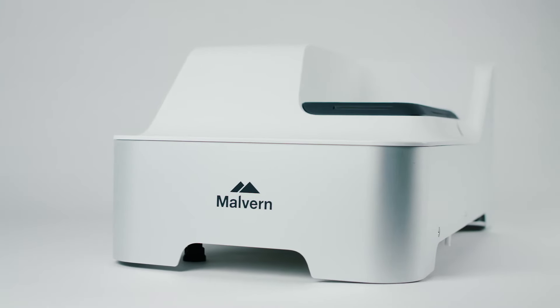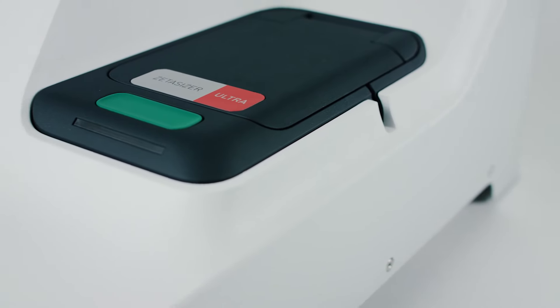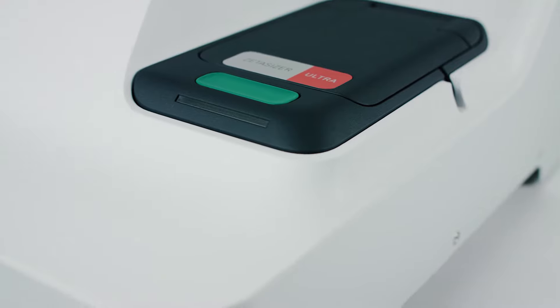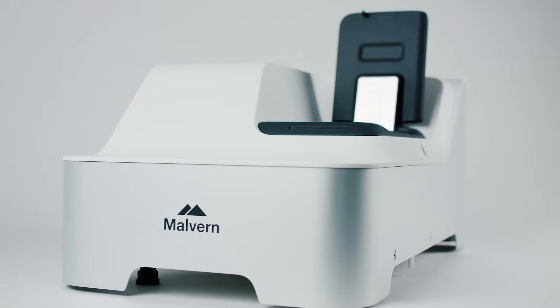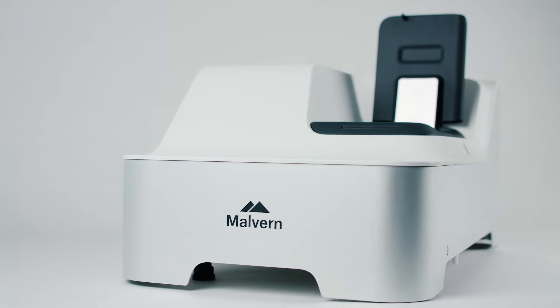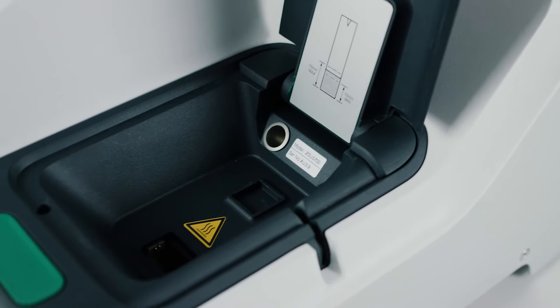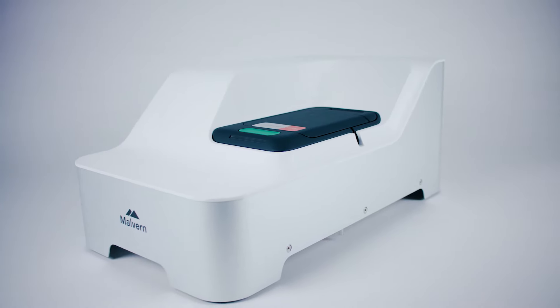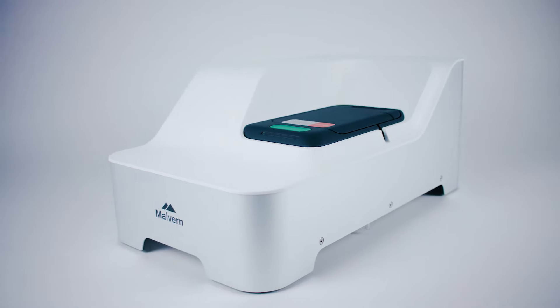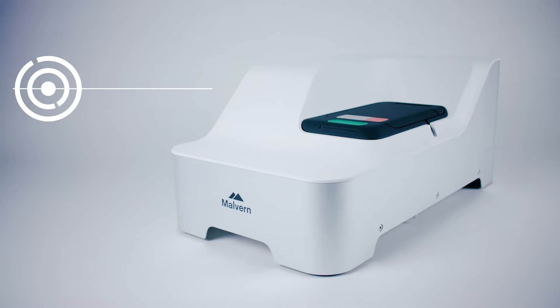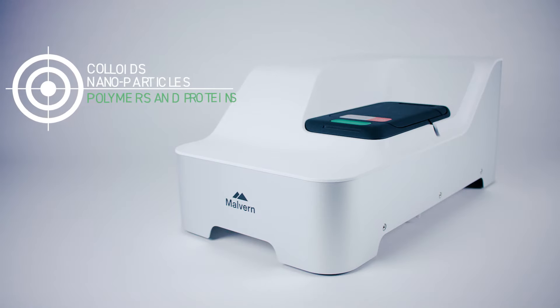The ZetaSizer Pro and Ultra are the latest additions to the ZetaSizer range, which combines dynamic light scattering and electrophoretic light scattering to measure the size and electrophoretic mobility or zeta potential of colloids, nanoparticles, polymers, and proteins.